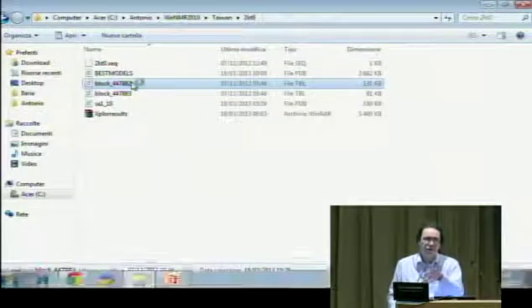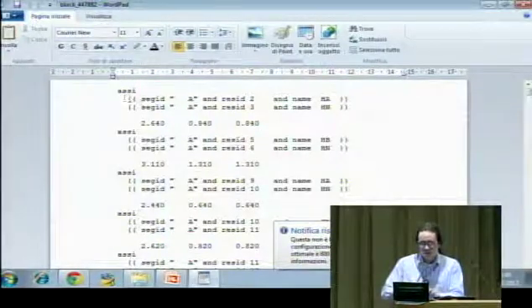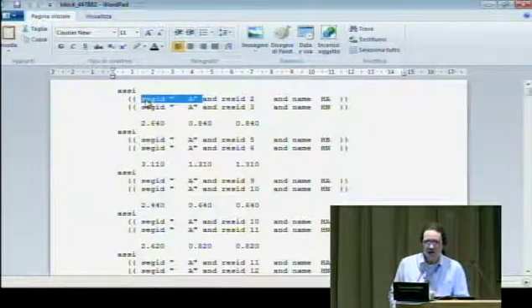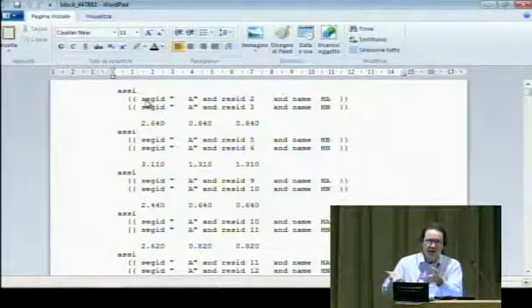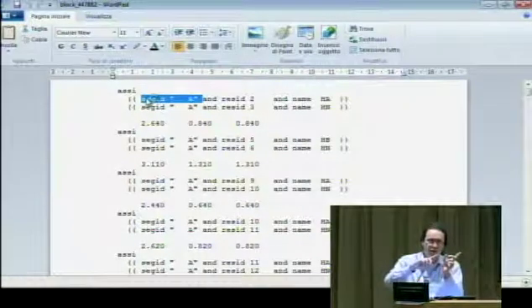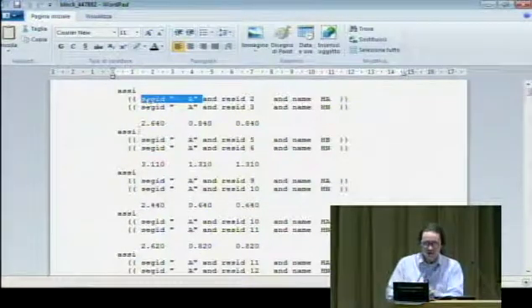this will be generated by the software you use to look at NMR spectra. So you see this is the format. This is an NOE between the H-alpha proton of residue 2 and the HN proton of residue 3. And in addition, you have this chain identifier A. This is actually optional in principle. If you only have one chain, you can tell your software to produce the restraint list without the identifier, but then you have to omit that from the calculation page. Vice versa, if it's here, it must be there. Otherwise, the program gets confused.